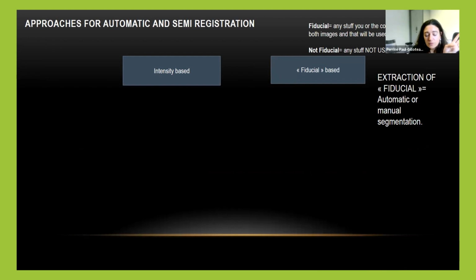For people who do not know about registration at all, what you have to know is that there are mainly 2 big approaches. So there is an intensity-based family of registration and what is called landmarks or fiducial-based registration.